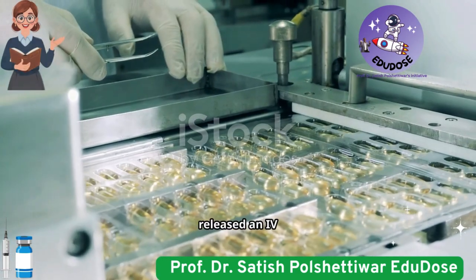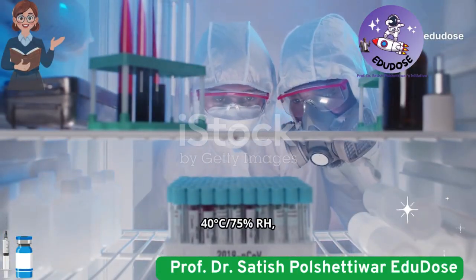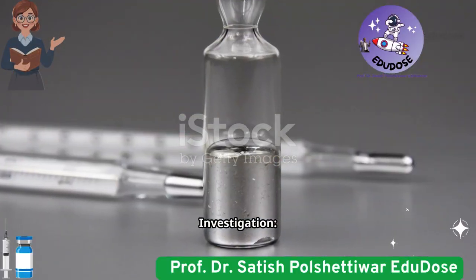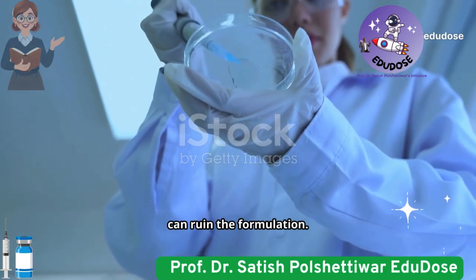A pharma company released an IV antibiotic in type 3 glass vials. After storage at 40 degrees C/75% RH, the solution became cloudy. Investigation: alkali leached from the glass, destabilizing the drug. Lesson: wrong choice of container can ruin the formulation.